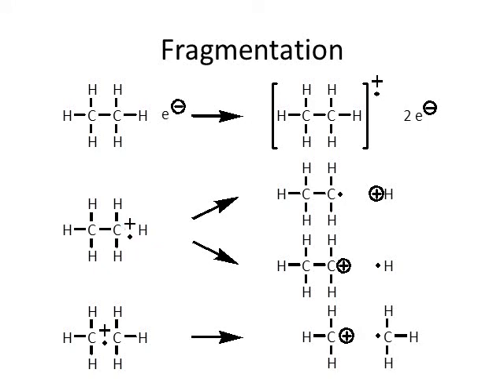And of course, if a covalent bond involves a shared pair of electrons, if there's only one electron shared, that's not going to be as strong, it's not going to be as stable. And so this thing can fall apart. This carbon-hydrogen bond could break apart, but it could break apart in one of two ways.